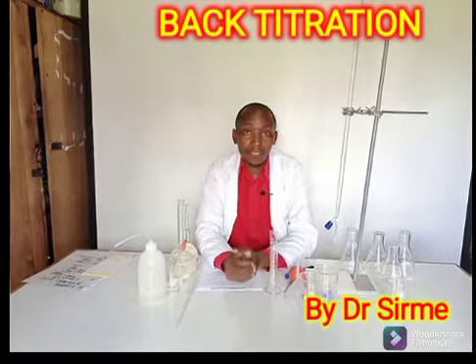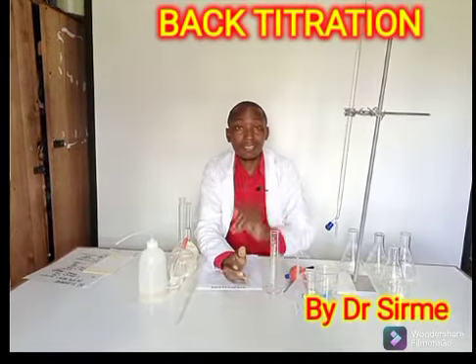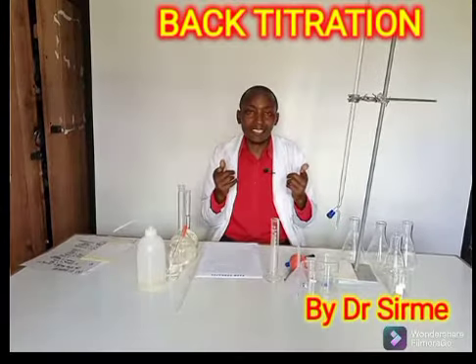And for today, we're doing back titration. In one of my previous uploads, I did a direct titration. But for today, we want to go to another type of titration, that is back titration.